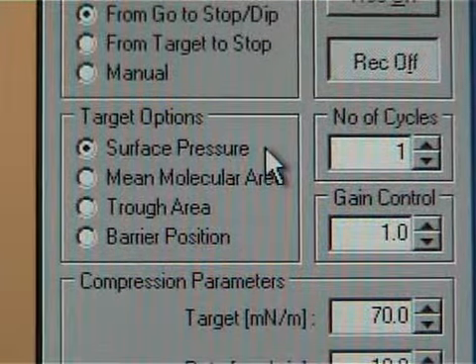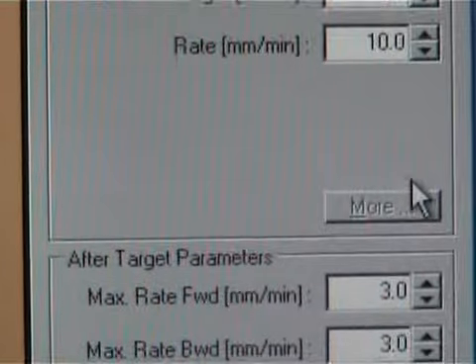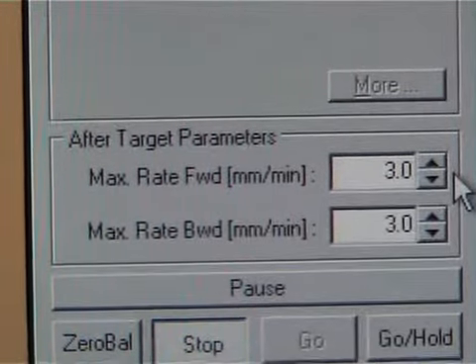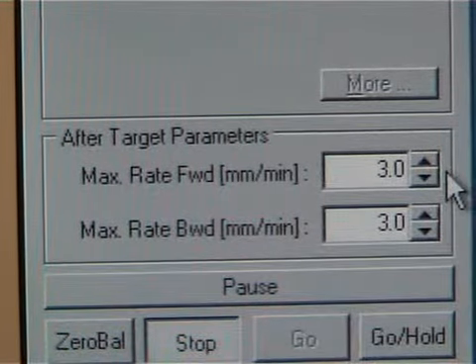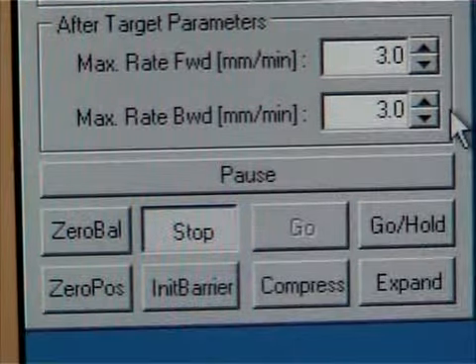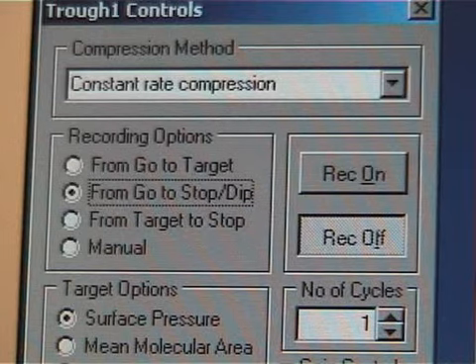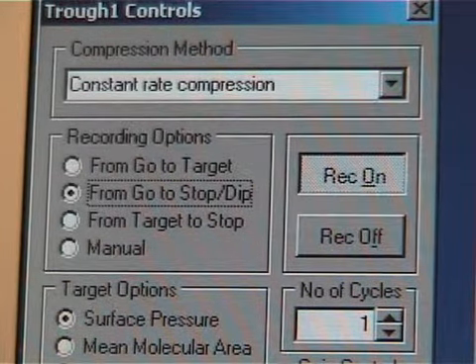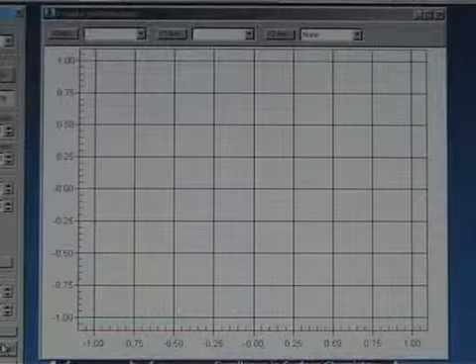The after target parameters should be approximately half of the dipping speed. Once the organic solvent has vaporized, press the go slash hold button. The recording will automatically start and the barriers will start compressing the surface.